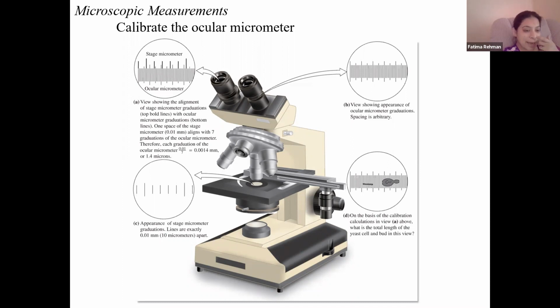So we do this counting small objects lab where we count the number of yeast or number of cells in our sample. And if students forgot to adjust light, they would be like, I don't see anything. My partner sees thousands of them. I don't see a single one. And all I would do is go to their microscope and move one little switch, and they would be like, oh, there they are. So you don't want to adjust them higher. You want to adjust the light to a lower setting.